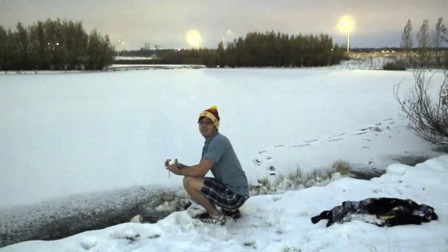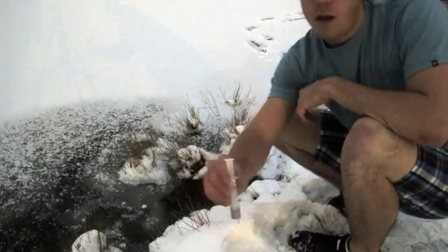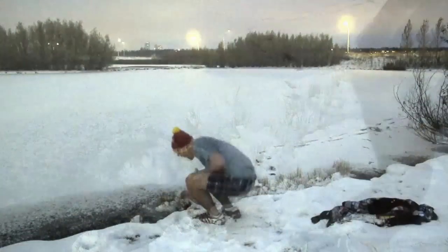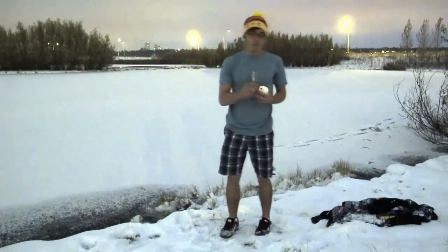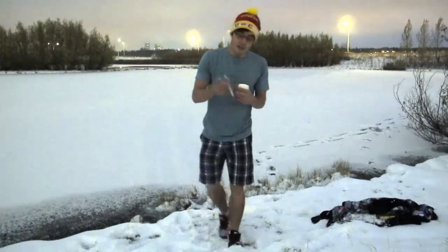Once you've penetrated the layer of ice, now you can take a sample. And now, with your precious water, you can inject the sample into the biosensor cartridge, which would, theoretically, contain our bacteria.